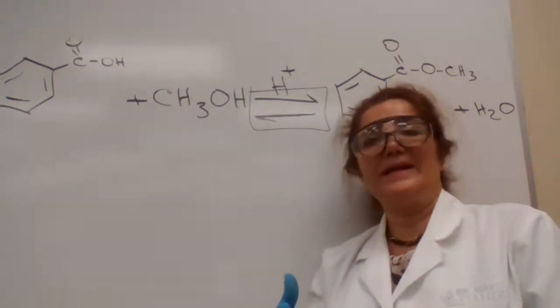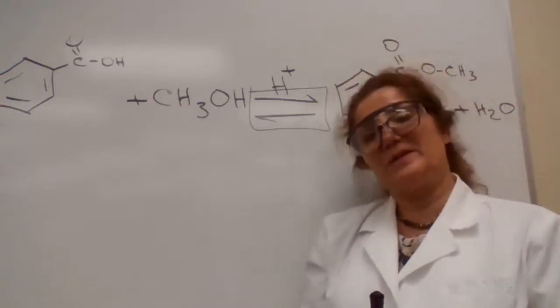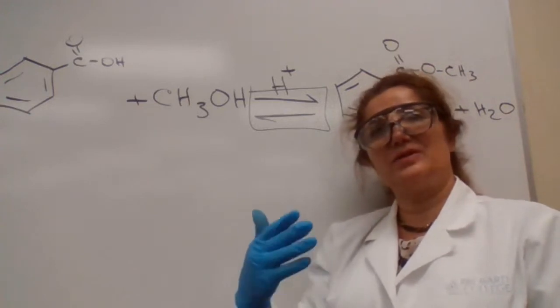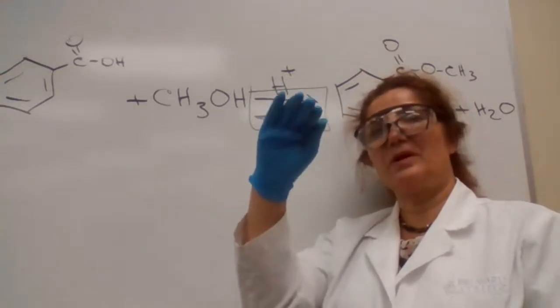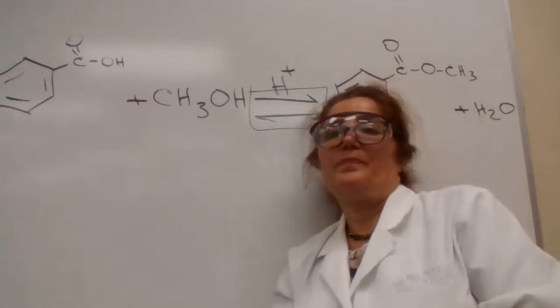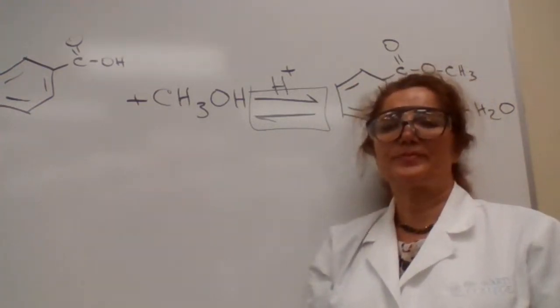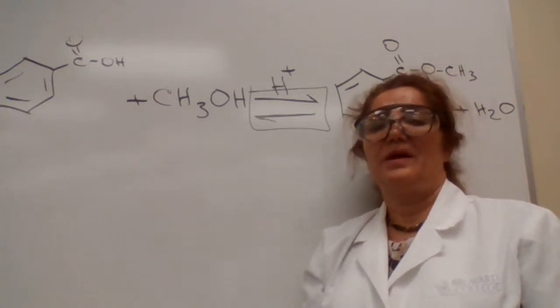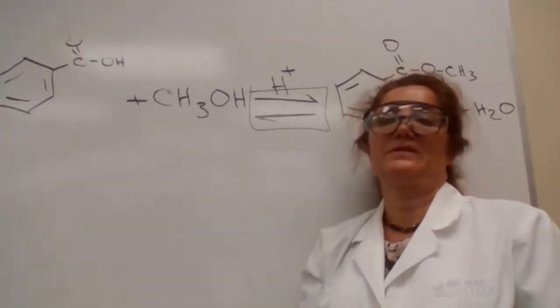Gentle boiling is boiling that produces vapor and keeps the temperature high at the boiling point of the solvent, but at the same time you don't lose the vapor. It allows the vapor to condense from the condenser back into the boiling flask. So any other idea? Any other suggestions? Why can we not heat up to 100? Are we able to heat up the system that we have now to 100 degrees Celsius?